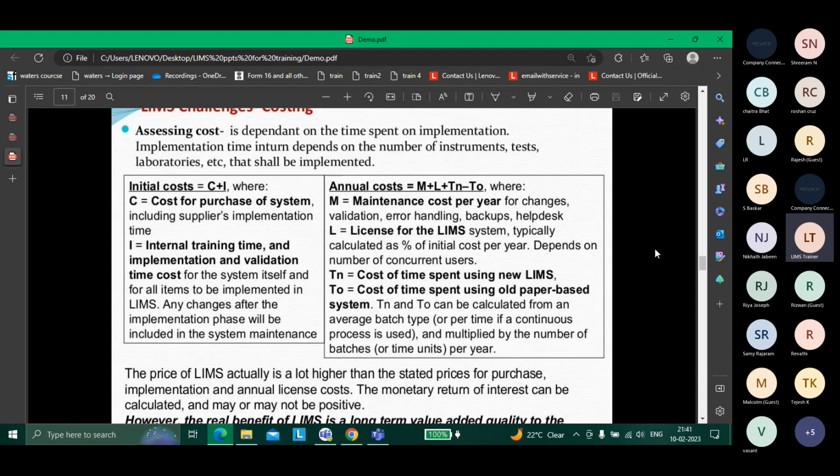First of all, you need to understand what a sample is, what the sample life cycle is, what happens when you receive a sample, what happens when you enter all the values, how you enter results. You first need to understand the sample. Then you understand how that sample is built. Some analyses are there, some components are linked. How those analyses are built, what those components are, what the flags for that analysis are, whether those components are mandatory. It is step by step.